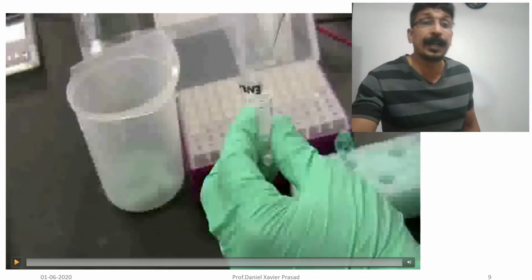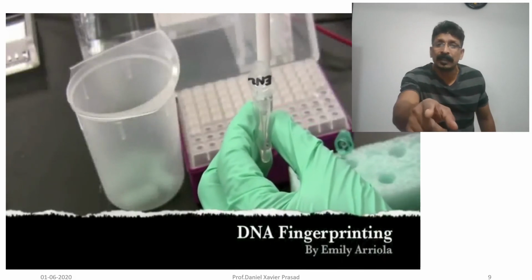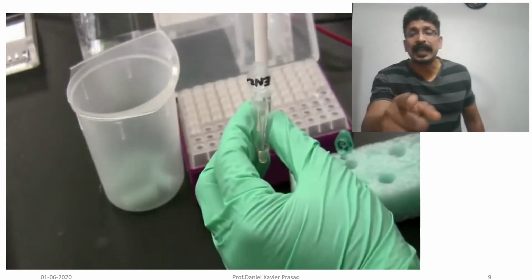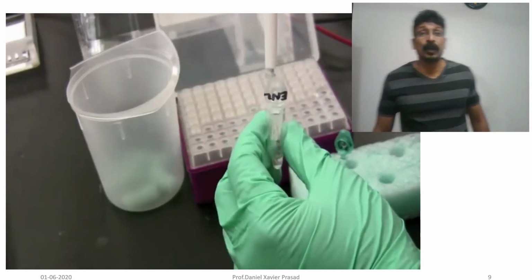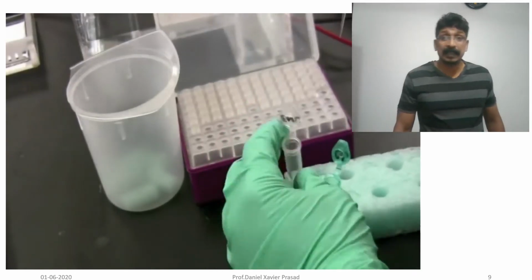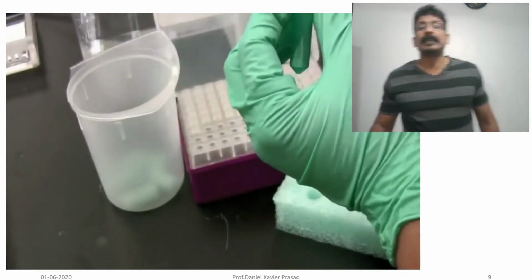Here, this researcher is preparing a sample, same as what you have seen in the last video for HPTLC. Understand? This is electrophoresis, and here he is preparing a sample and using enzymes.